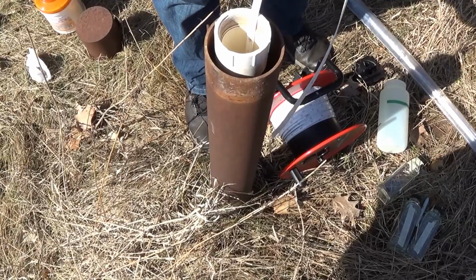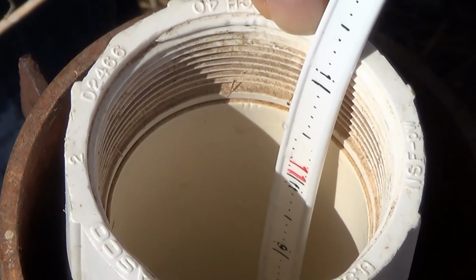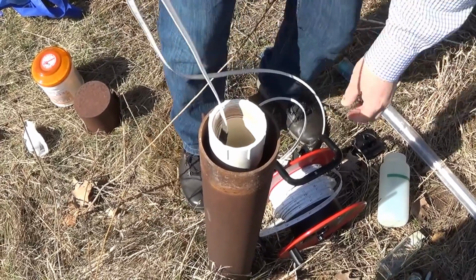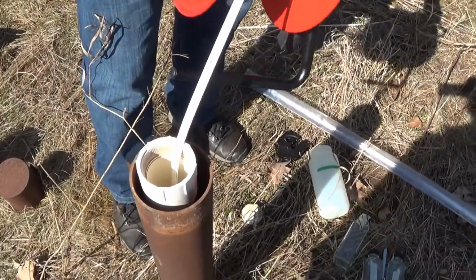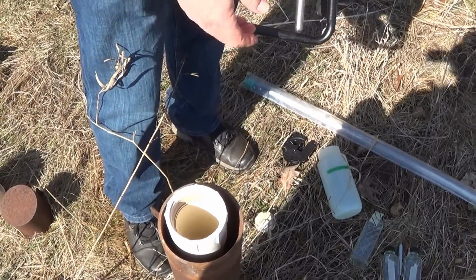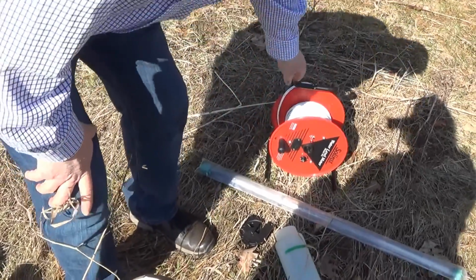So let me pull that up. So it's about 11 feet, maybe 1 inch, 1.5. I'm sorry, 11.15 feet. This is in tenths. So let me write that down. Okay. And then I'll demonstrate how we calculate. Oh, that worked. You can see that little guide is helpful. But let me pull this up here quick. And it's still wet, so pull that off this way. And what was that, 11.15 feet?